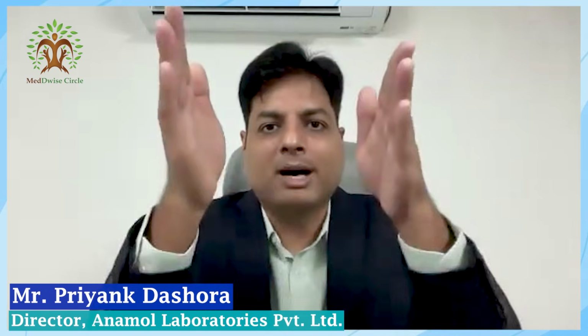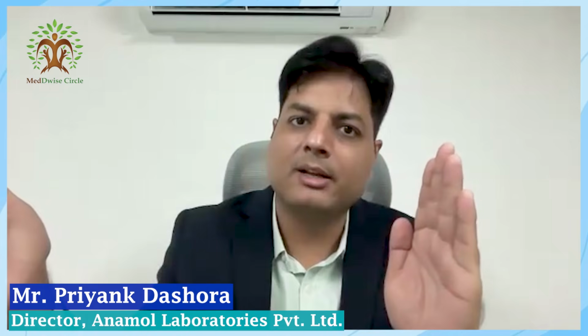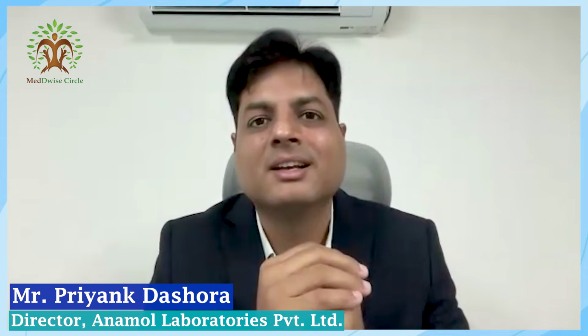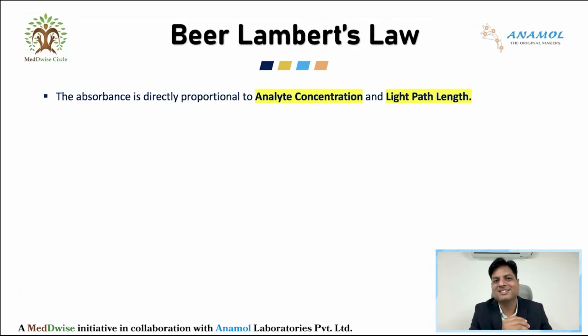Therefore, we say that absorbance is only directly proportional to concentration of analyte because the path length is fixed at 1 centimeter. So this does not change. 1 centimeter is the distance between the entry point and exit point of the light. So we avoid any variation from path length by fixing the path length.